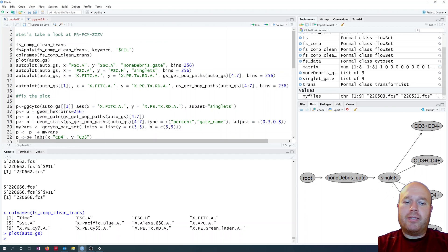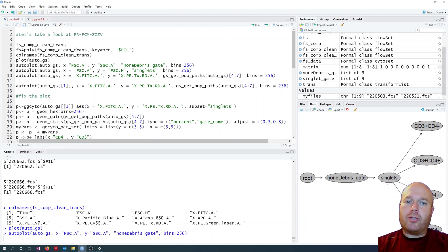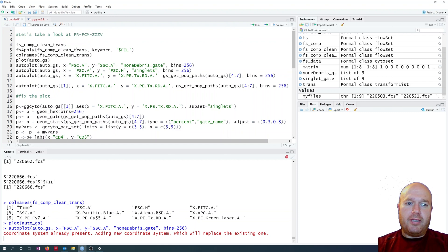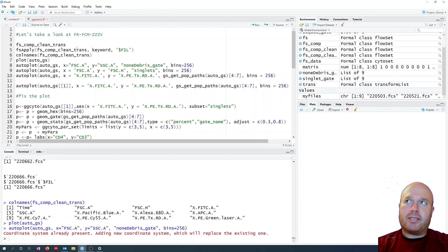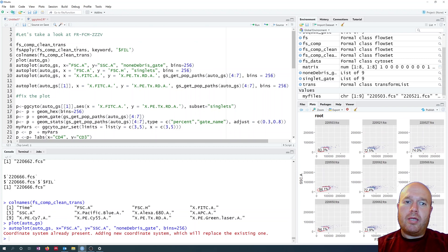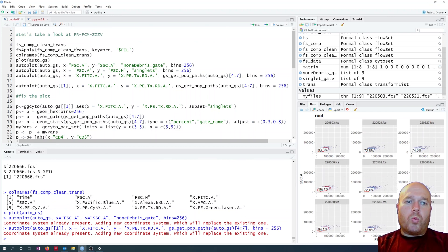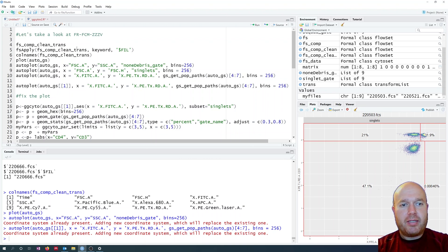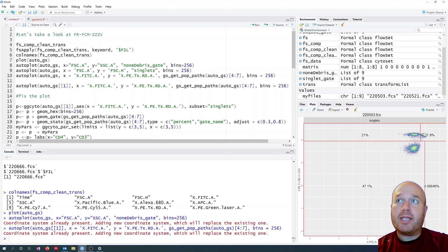This is the same as we did the other day and we can look at the autoplot outputs. Using default settings, it shows the forward/side scatter, the singlet gating, and the FITC versus PE-Texas Red. One of the issues with autoplot is that you don't have any control over where the labels are, the scaling, or the layout in general. It just creates a quick plot.